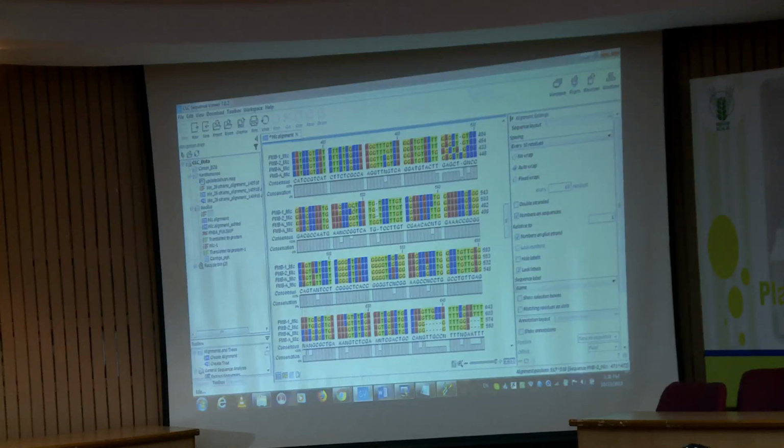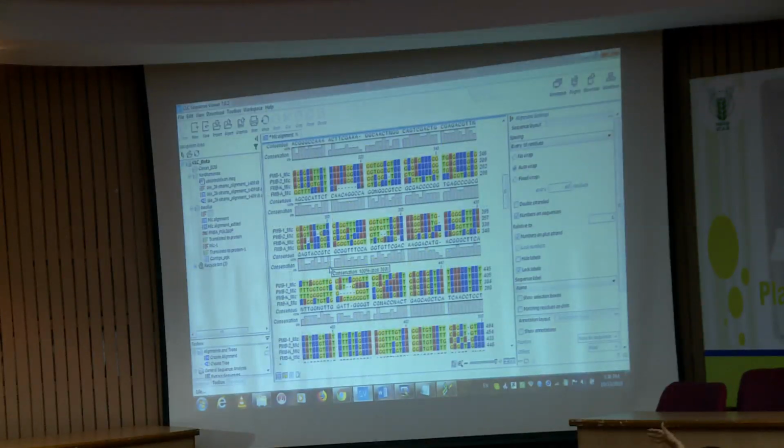So, this is one step of editing. Another step is while we were doing the multiple alignment. Here too many dissimilar things are there, otherwise in the beginning it generally does not match, at the end it generally does not match, because one sequence will start at one point, but maybe another sequence will start 10 bases downstream to that, right, but we want to make it uniform. So that step is called the trimming of the 5' and the 3' end.